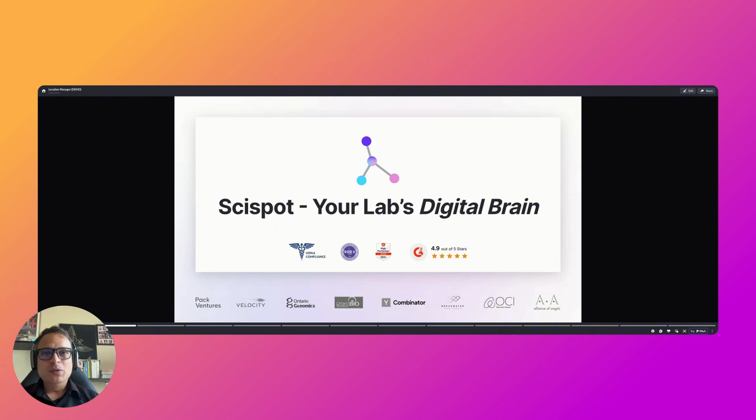So there's a lot we can do in this day and age to help out labs when it comes to building an alternative ELN, an alternative LIMS. And today I'll be diving deep into deep freezer management, if you will, and how AI can be used to track your samples, your locations, and build a compliant chain of custody, using natural language, and also assisting the end user, the wet lab scientist, on where their samples are. So yeah, let's dive right into it.